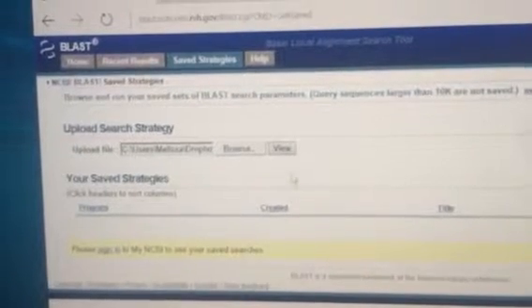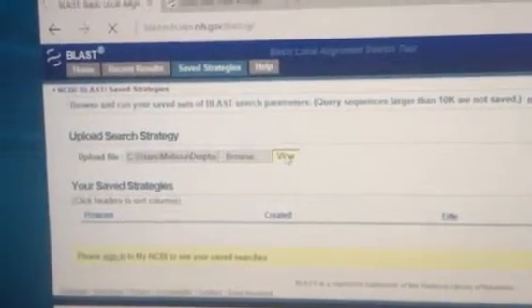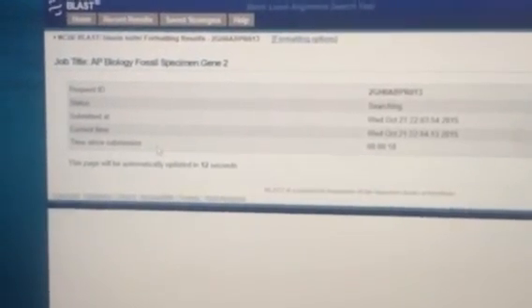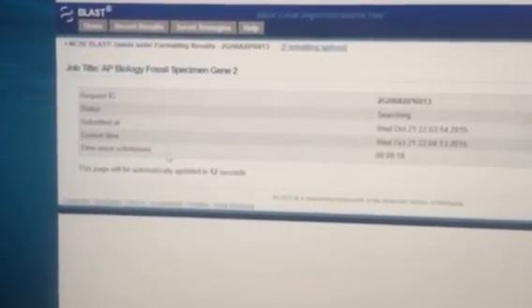And then you'll do the same thing. View it. There's Dave's actual gene. Go down to the bottom and BLAST it. Once again, you'll get the results. It may take a little bit of time, and you can go see what the closest match is, and you can also look at the distance tree. So you'll do it for all 4 gene sequences, writing down again the genus and species, writing down the max score. And then you'll have to determine, based on the max score, who is the closest match to Dave.